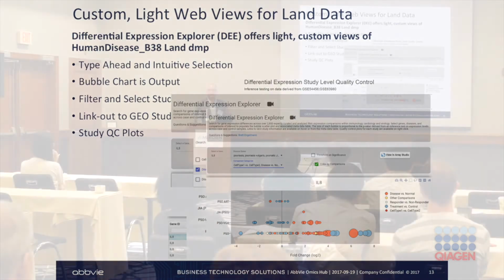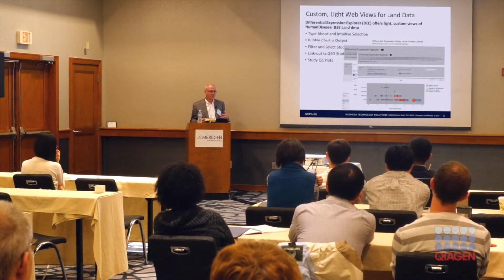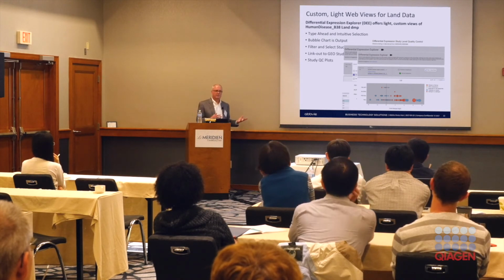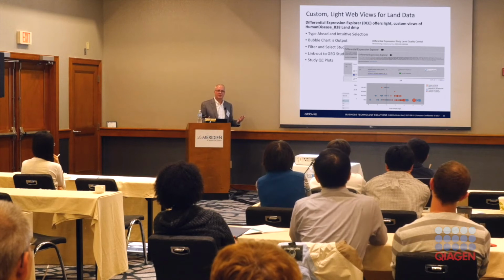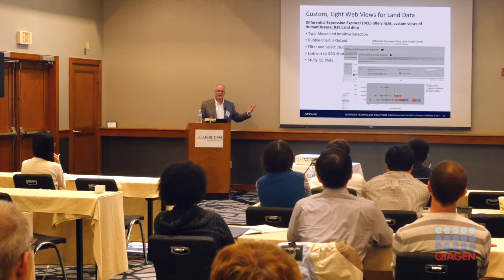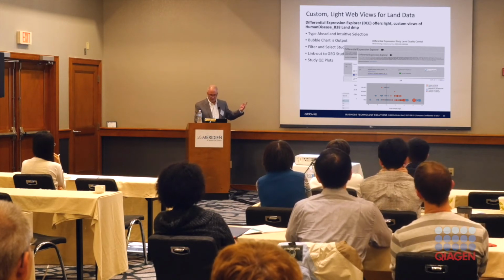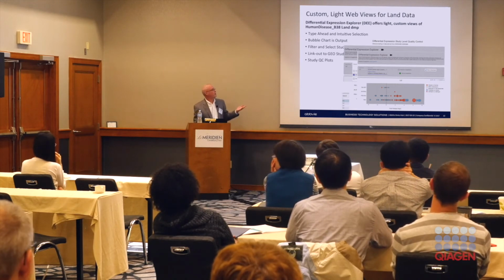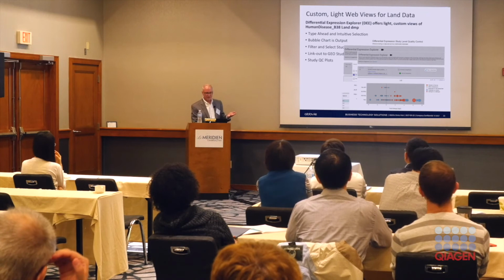And you may know that in this case, we're dealing with biologists, chemists. But then for this work to be accepted, the statisticians have to believe it. They want to know, is this study any good? That's typically the thing. So in this case, Brett Engelman made this, brought in study QC plots.